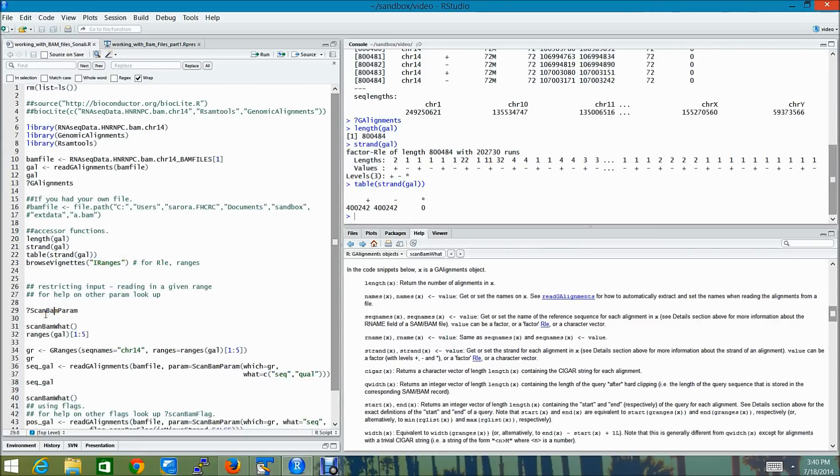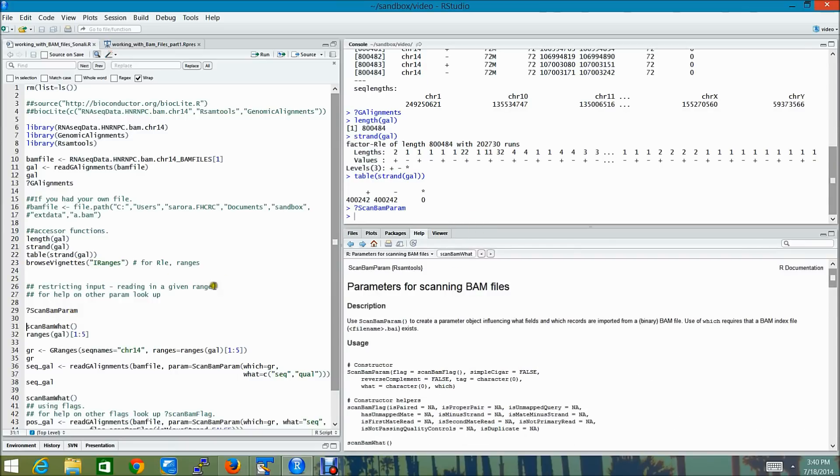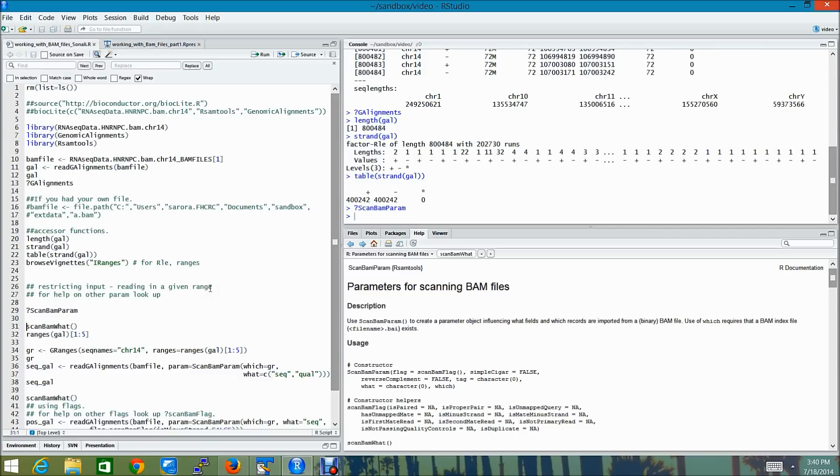Let's proceed to the second part of our demo, where I'm going to talk about how we can restrict input while reading in from a BAM file. So we're going to use scanBAMParam here. ScanBAMParam is actually a parameter object influencing what fields and which records are imported from a BAM file. The use of which requires that a BAM index file, typically ending with .bai, exists.